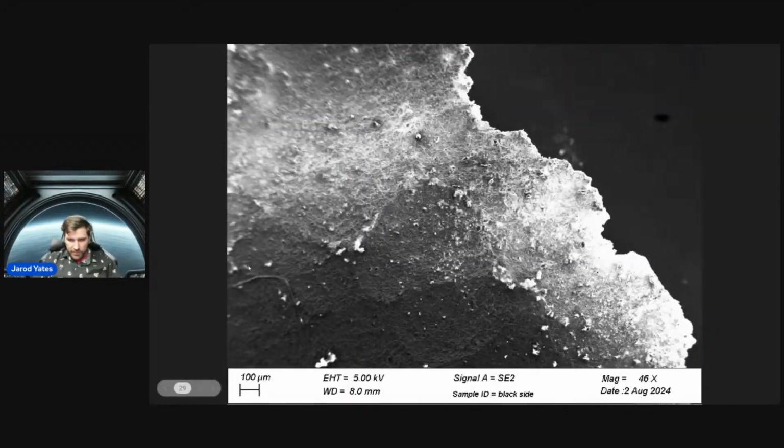Well, we did make sure that we got that on the SEM. And as you'll note, we're real dim at 5 kV. But all of these little zinc-lead seed microsphere things, those fluoresce. Anything that's metal is going to fluoresce and be really bright. And the fact that this thing doesn't fluoresce at all suggests that it's probably not made of metal.